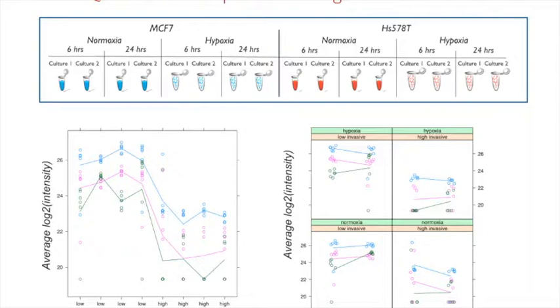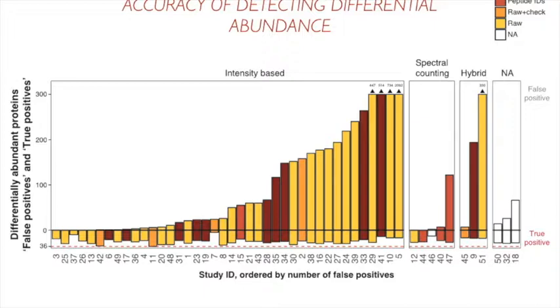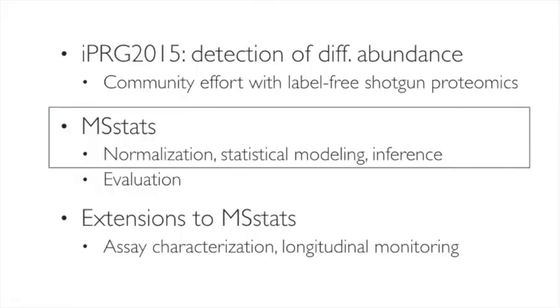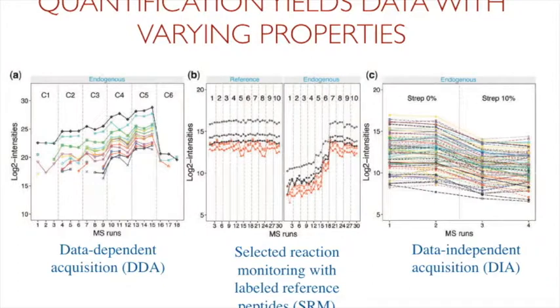And we would like to argue that we can do better than that. And by better, I mean pretty much this, right? So we can be more specific and hopefully also more sensitive than just working with pairwise t-tests. Okay, so now what are the challenges? So of course, this type of behavior depends very much on the experimental workflow that you use. So for example, if you use a shotgun label-free experiment, you will probably have a relatively small number of features per protein, maybe quite a few missing values and quite a few interferences or deviations between features.